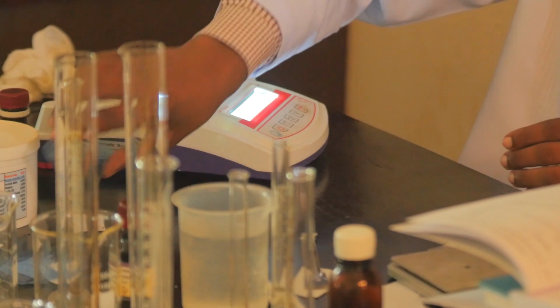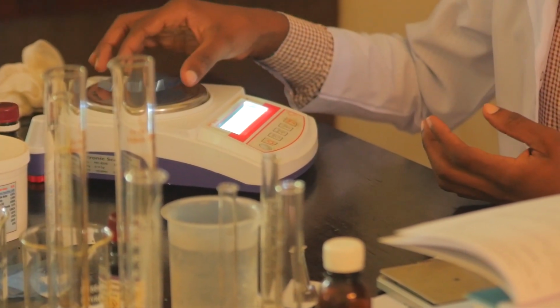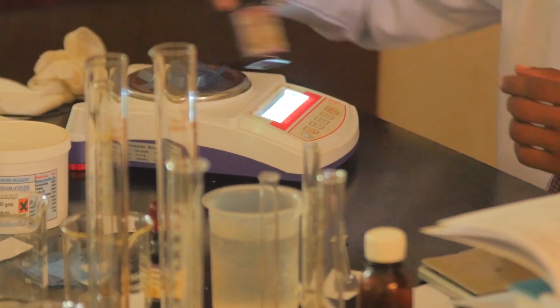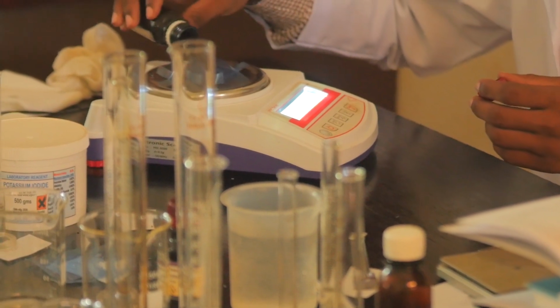Thereafter, we are going to weigh iodine, 0.5 grams. Put your film, then neglect the weight by pressing the tare button. Then now let's check how to make it.